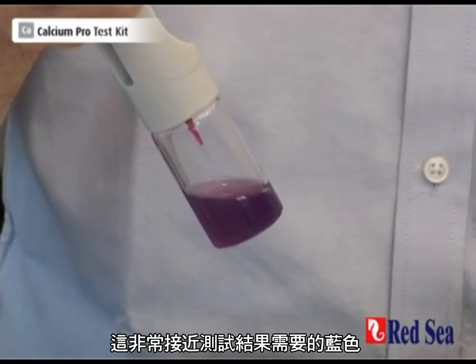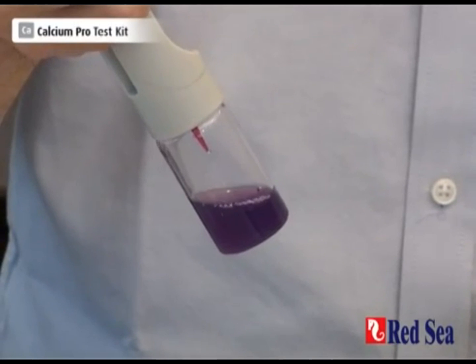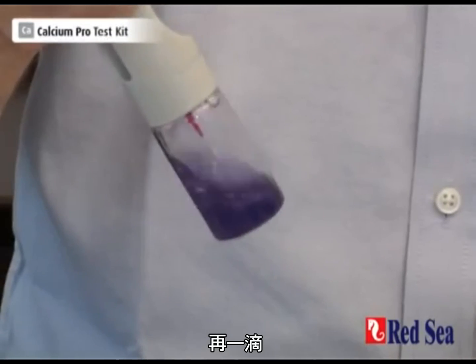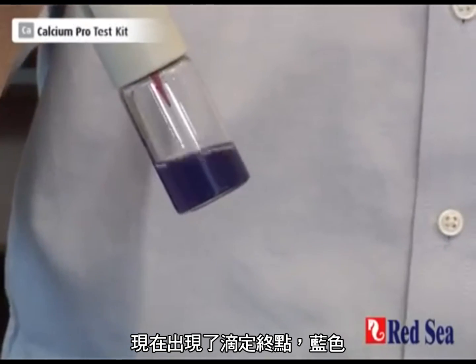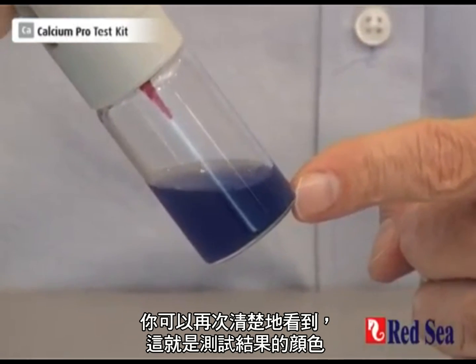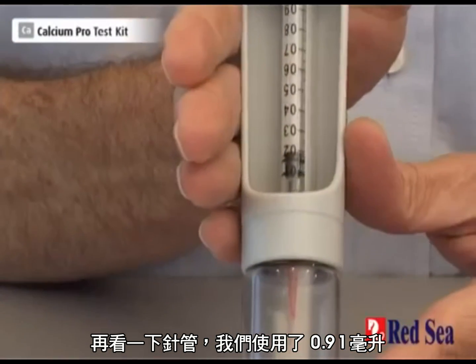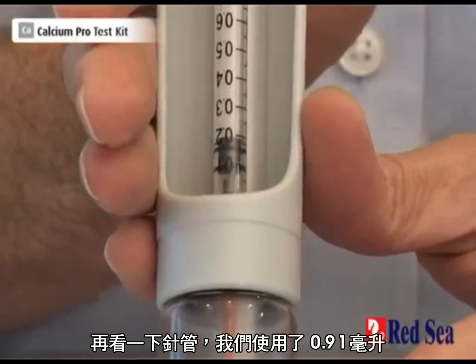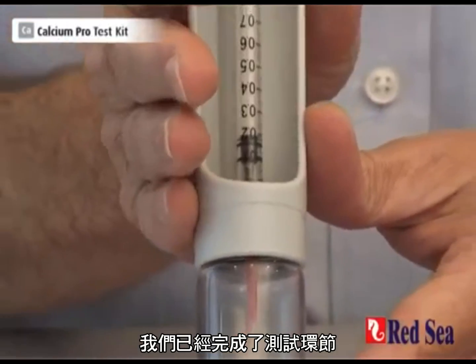What we're looking for is blue — one drop at a time. Another drop. And one more drop. And we've got our blue color at the end point. Just for clarity, this is the color you are looking for. When we look at our syringe, we see that we have used up 91 hundredths of an ml. So we've completed the test, and that is our end point.